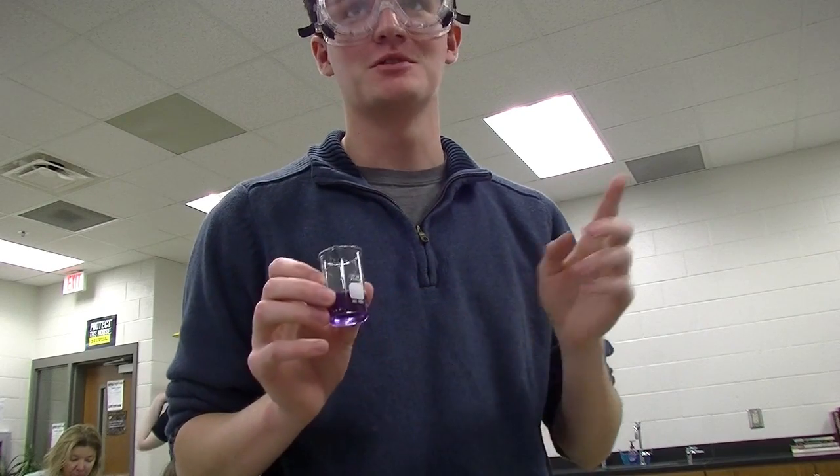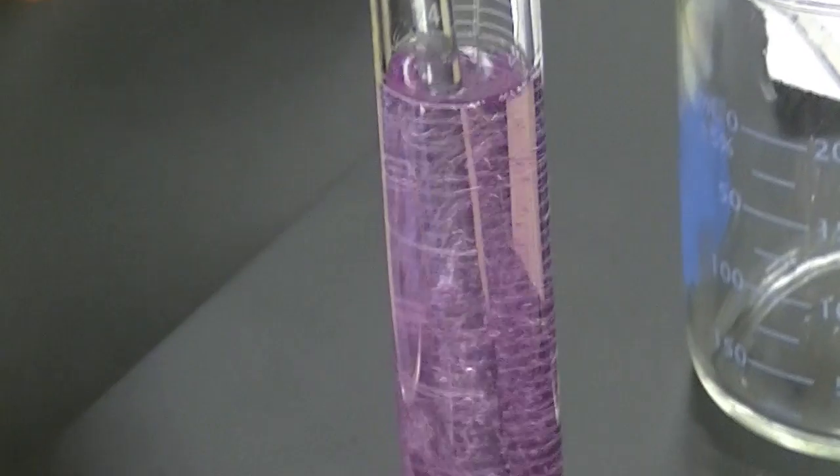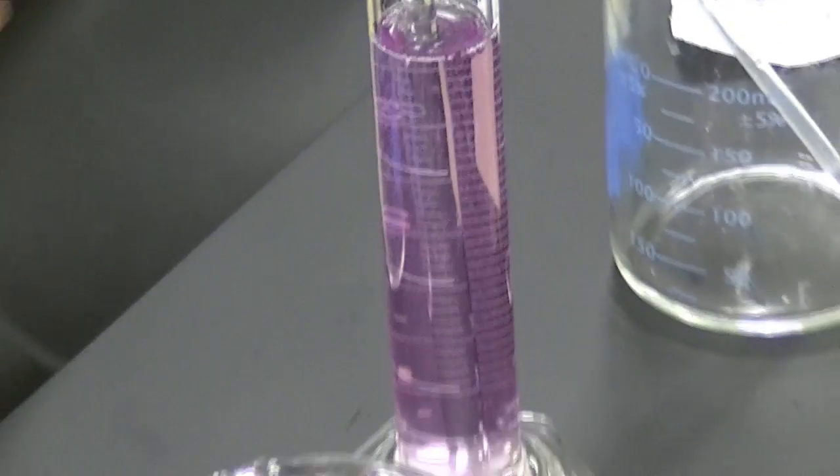This is cabbage juice, which we're using to test the pH of our solutions. It's pretty purple.